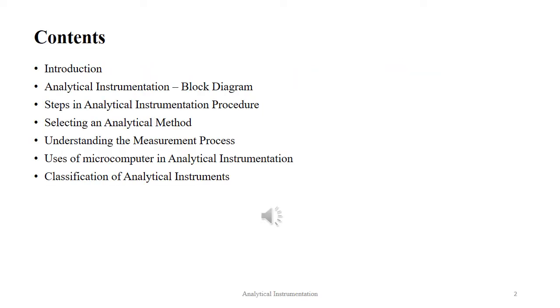Good morning viewers. Today we'll have a discussion on the introduction of analytical instrumentation. In today's discourse we'll cover the following topics: introduction, analytical instrumentation block diagram, steps involved in analytical instrumentation procedure, selecting an analytical method, understanding the measurement process, use of microcomputer in analytical instrumentation, and finally the classification of analytical instruments.